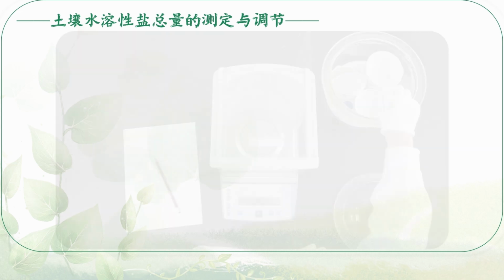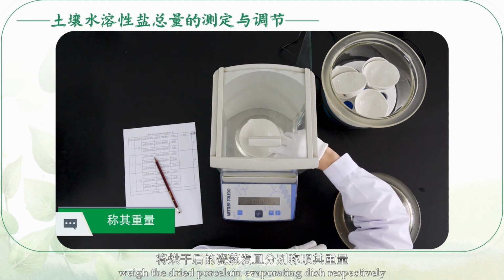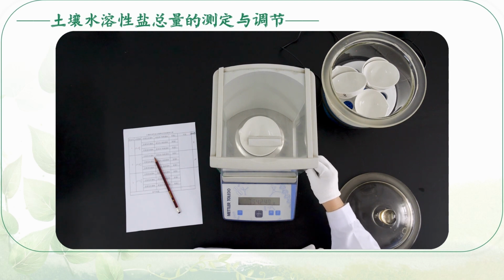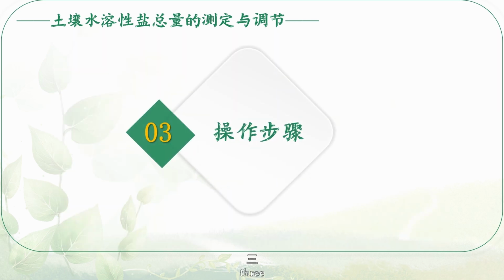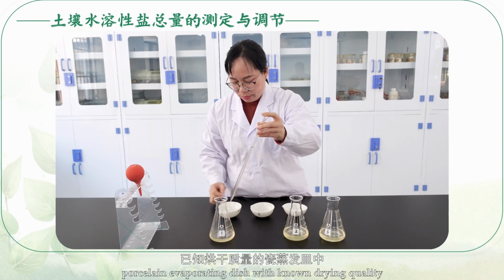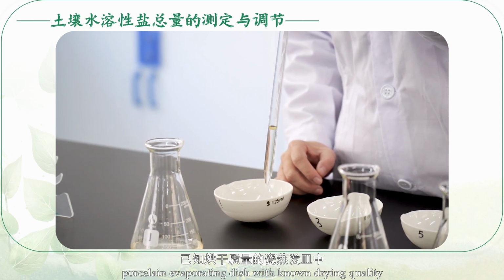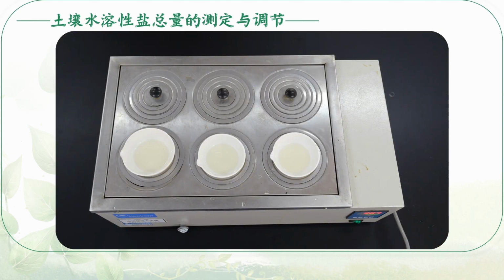2. Weigh the dried porcelain evaporating dish respectively. 3. Pipette 20 milliliter of soil leachate, put it in a 100 milliliter porcelain evaporating dish with known dry quality and evaporate it on a water bath.